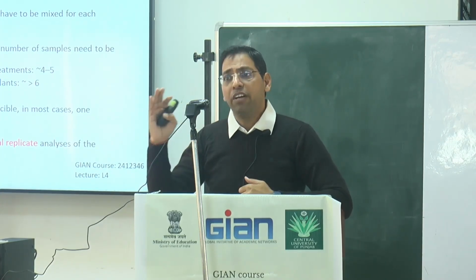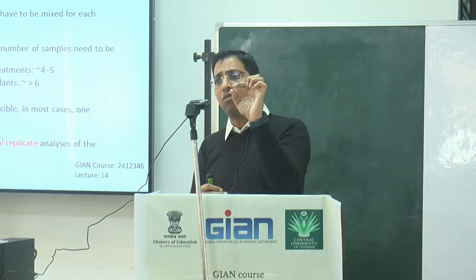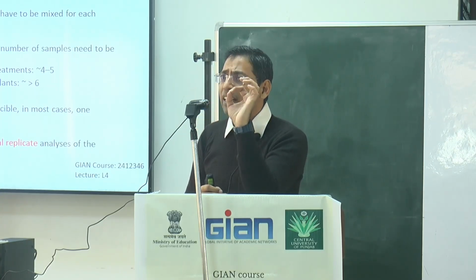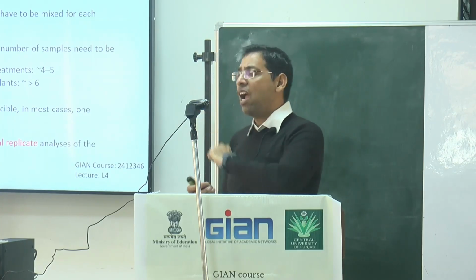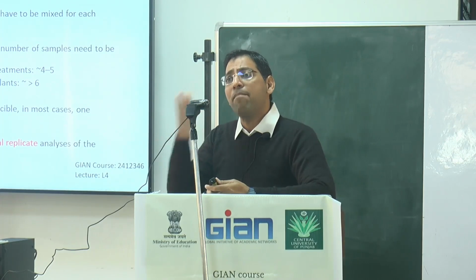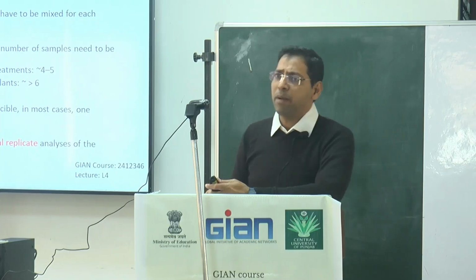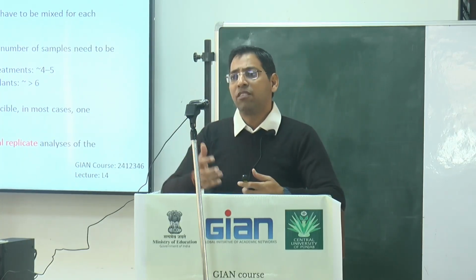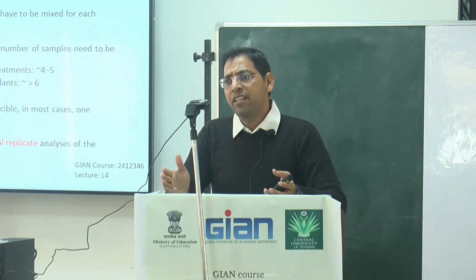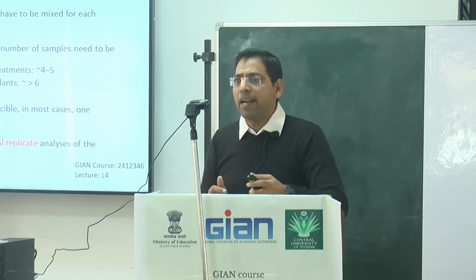And you only work with that biological sample. So we have to collect the sample from 5 to 6 plants and mix them, so that we can minimize that type of error. Second is the biological replicates. Biological replicates means how many samples you are collecting for a particular experiment. Today you are collecting 5 samples, so you have to separate them into different sets, and every set has the same type of sample. Those we tag as biological samples.